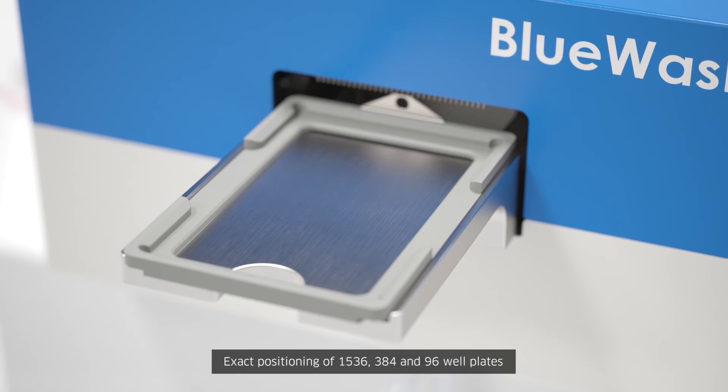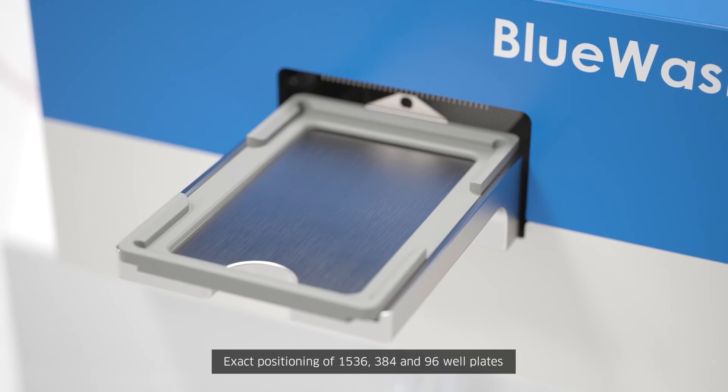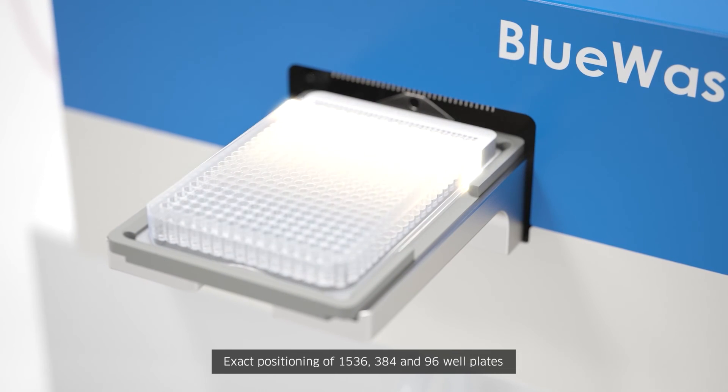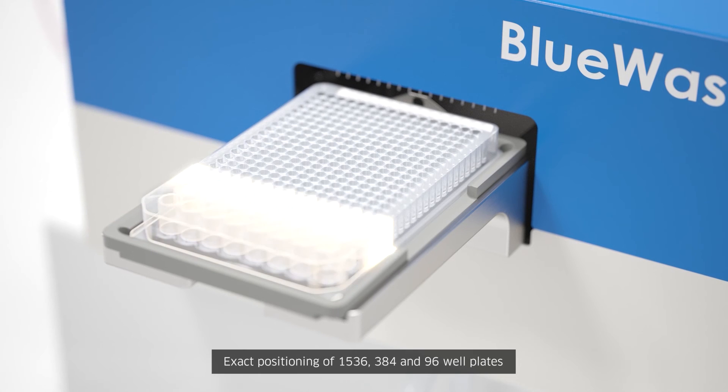Blue Washer's patented linear drive positions plates with micrometer precision for dispensing into 1536, 384, and 96 well plates.